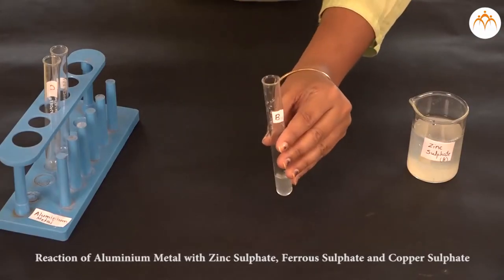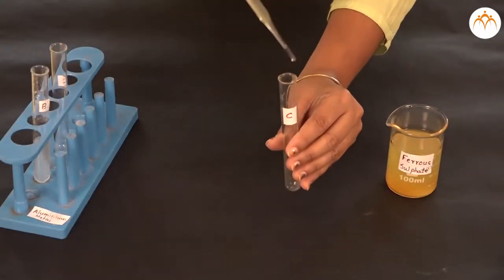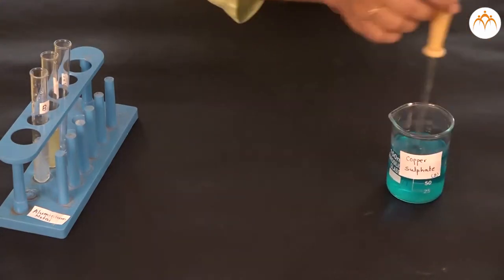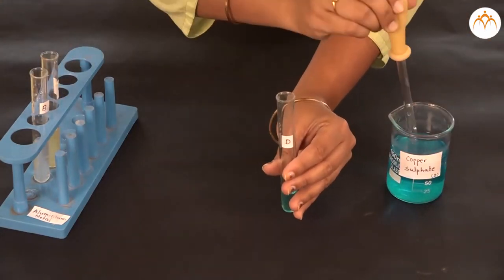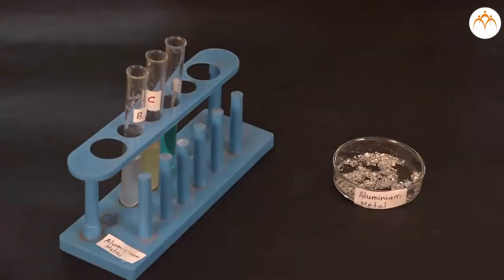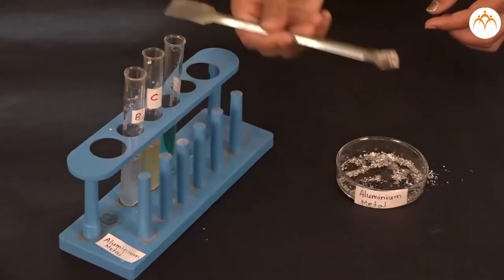Part A. Let us first perform the reactions for the metal aluminum. As aluminum metal cannot react with its own salt, we are going to take other three salt solutions in test tubes. Add aluminum metal to all the three test tubes. Observe the reactions.